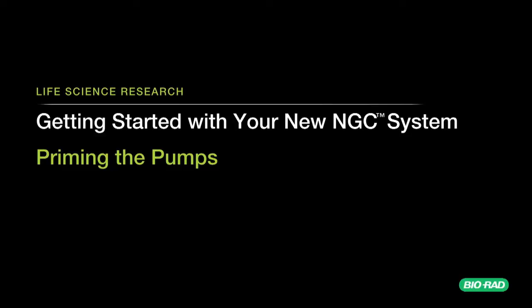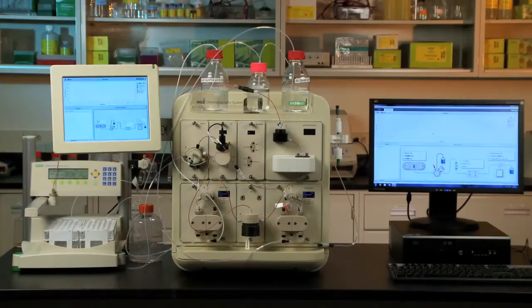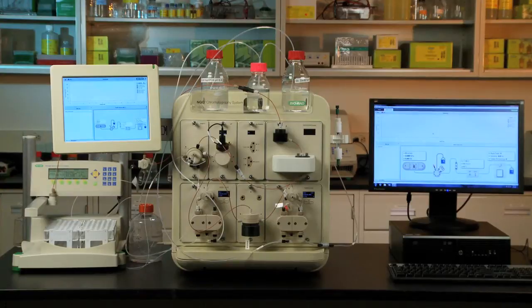This video shows how to prime your NGC system before running the pumps. Prime the system pumps at installation, when you change buffers, when you observe fluctuations in pressure or flow rate caused by non-degassed buffers, or any time air gets into the inlet lines.